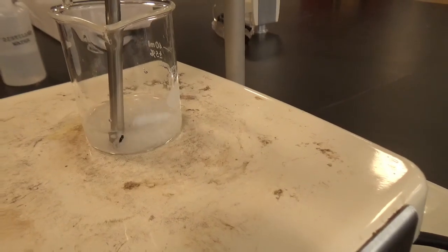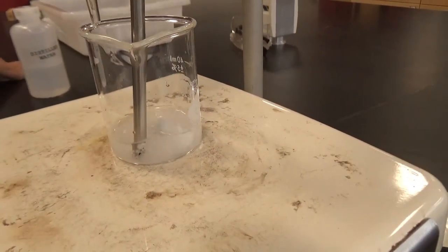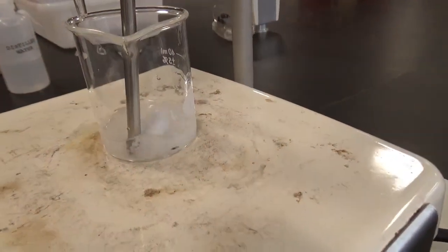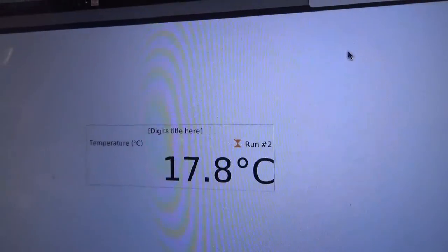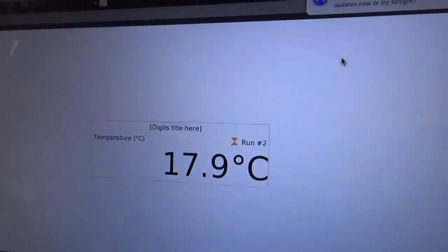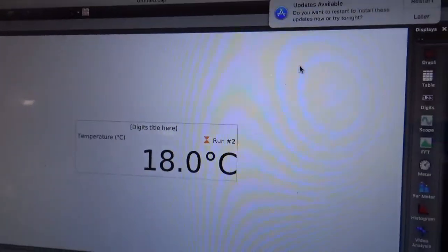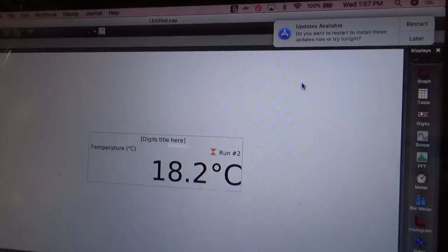Yeah. So how many more of these labs do we have to do, Mrs. Saya? Oh, we have 2 more. That means 2. We've done like 10 of them. That means we're going to get more silly. No, folks, we didn't have anything special for breakfast.